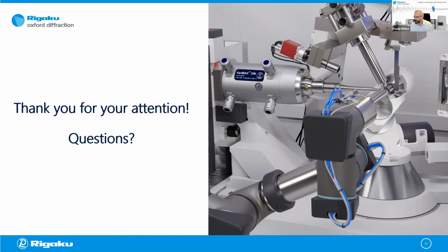Is there any sort of selective inclusion in the case of mixtures of different guests by using the sponges you have shown? So the crystalline sponge method works best if you have pure molecules. So typically for unknowns, you would run a chromatography beforehand, because what happens is that you already have solvent molecules in the pores, then the analyte that you want to analyze. And if you then have a third molecule and all are overlaid in your crystal structure, you will not find what you are hunting for. So sample prep is crucial here.